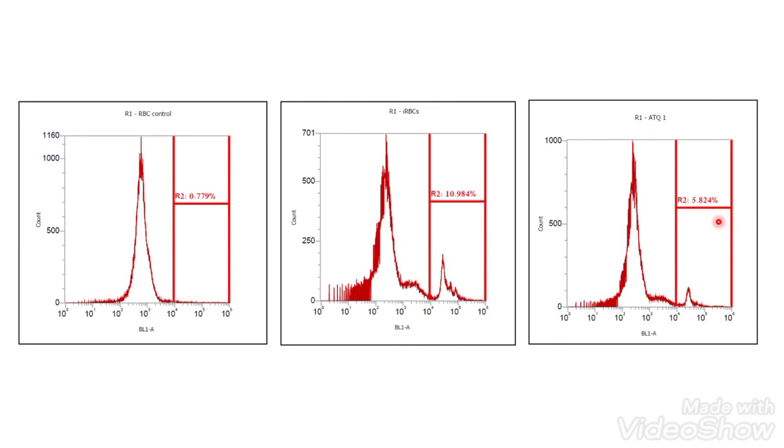So from 50 ml blood, we get 5,000 cells. So from 50 ml blood, you get billions of cells, and from those cells, you are isolating 5,000. That much sensitivity can be achieved by FACS or MACS. Yeah, so it is just giving the direction to the system that what cell you want to sort or what cell you want to take out from your population.